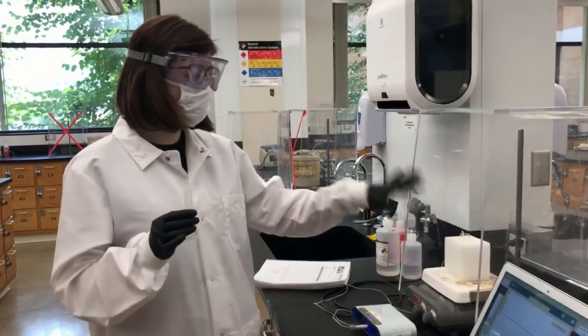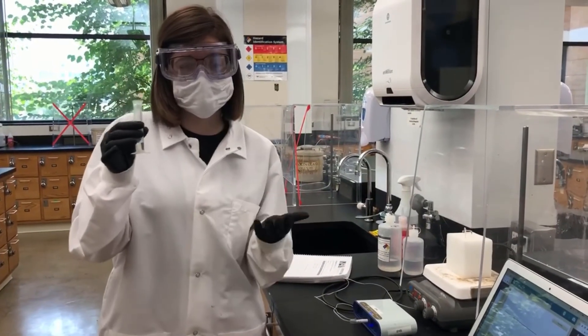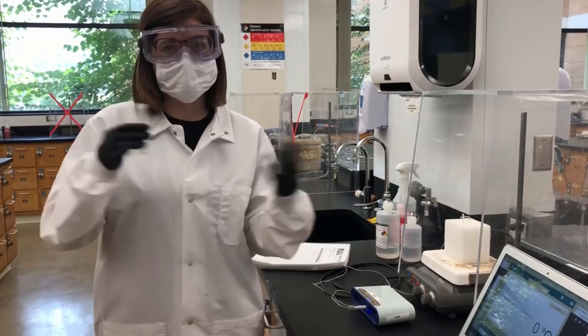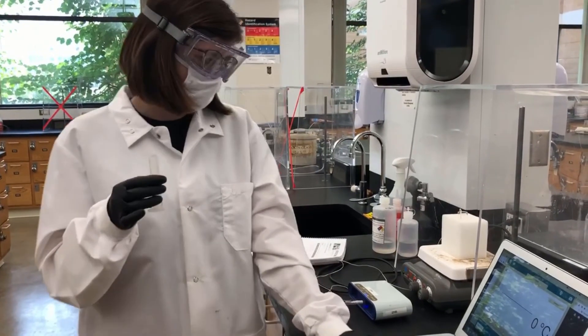I'm starting out with 8 milliliters of the bleach solution and 2 milliliters of my unknown because that's one of the stoichiometric ratios that could give me the highest temperature change. And I'm just going to press start on here.